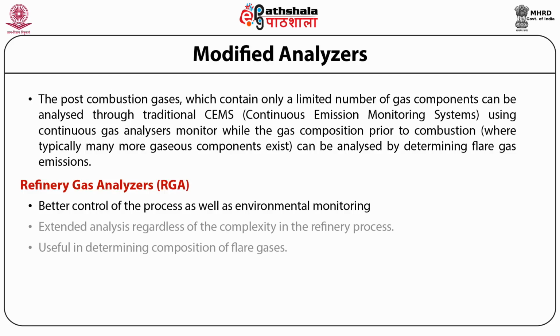The liquids extracted from natural gas are used as feedstock for many other petrochemical processes. The ethylene plants use ethane and propane as a feed, and isobutane is used in a refinery's alkylation unit. Gas chromatography is used in numerous processes throughout the natural gas liquids, NGL, plant and plays a critical role in optimizing the distillation tower operation and assuring that each of the product streams meets these specifications.